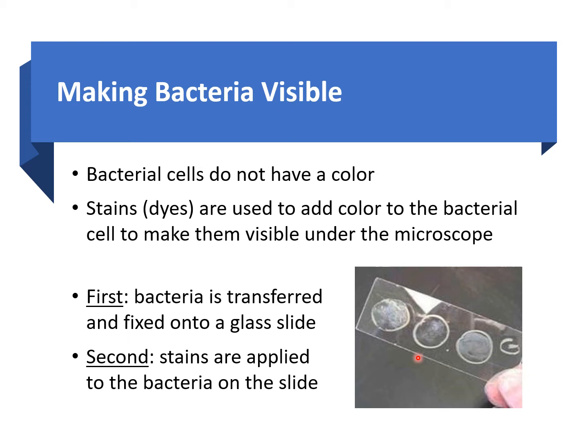So you don't want, as I said, your smear to look something like this, very white, because that would mean that you've transferred a lot of bacteria, and that's not good because when you take a look at it under the microscope, all the bacteria cells are actually going to be stacked on top of each other to the point that you're not going to even be able to see their shape or their morphology. So the thinner the smear, the better.